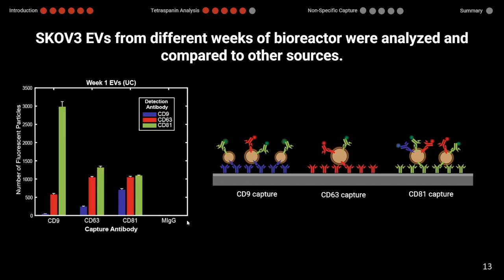Specifically, I think you're asking, with the biotin, we will get biotinylation of the proteins as well. And that is totally true. I would recommend doing a couple of different isolation techniques. Here we did ultracentrifugation initially, and then did size exclusion chromatography to get rid of any of the free proteins that would also be biotinylated. And that really helps with not getting that background of those proteins that also would be captured.